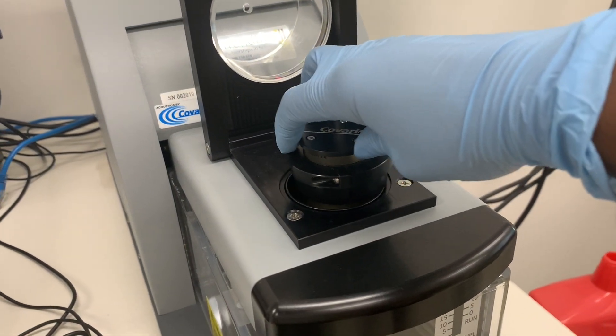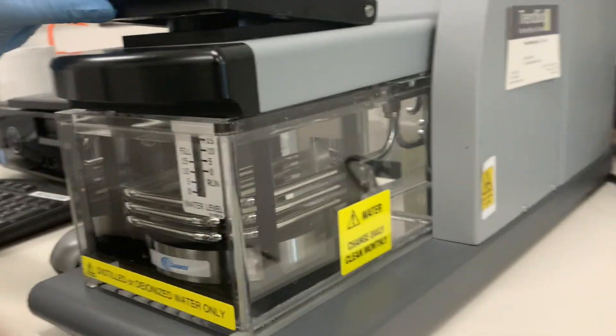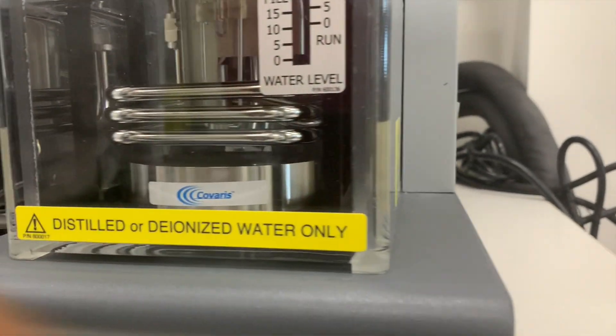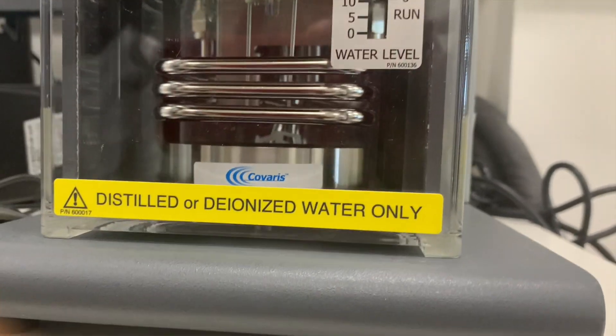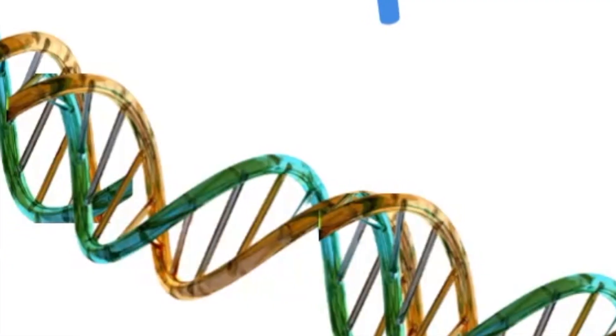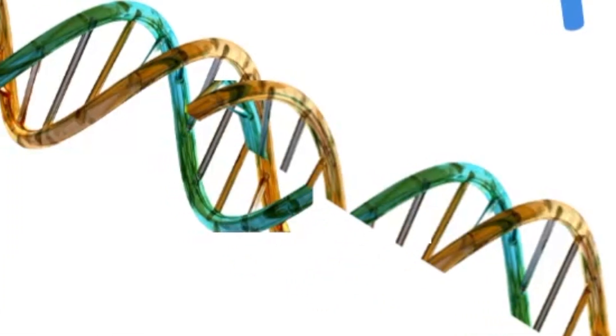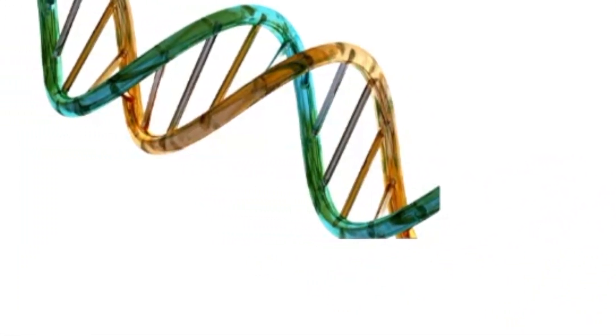The acoustic waves create bubbles capable of generating high resonance vibrations that lead to breakage in DNA strands. The sound waves cut hydrogen bonds in DNA molecules, causing single and double-strand breaks.